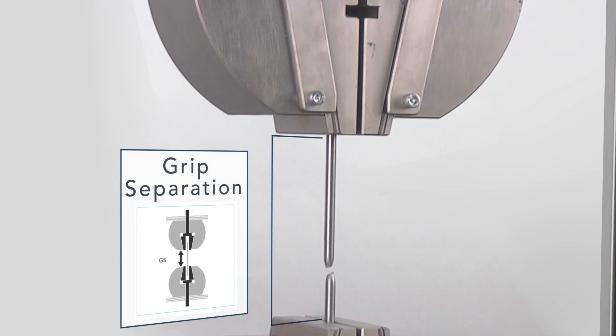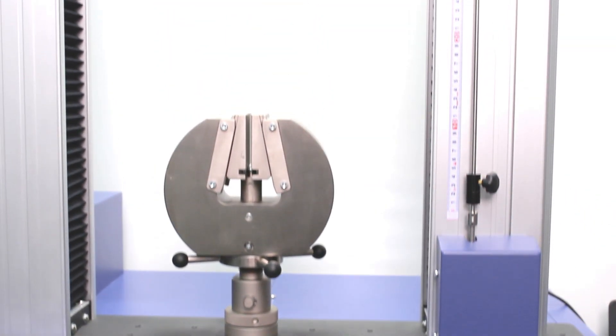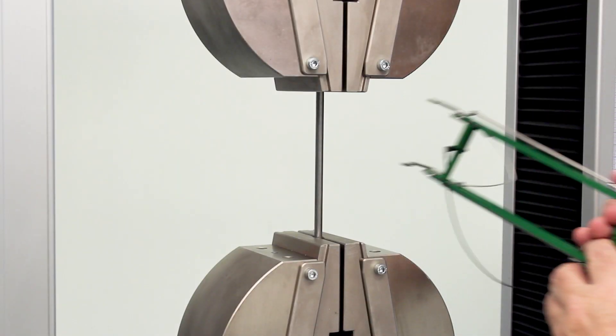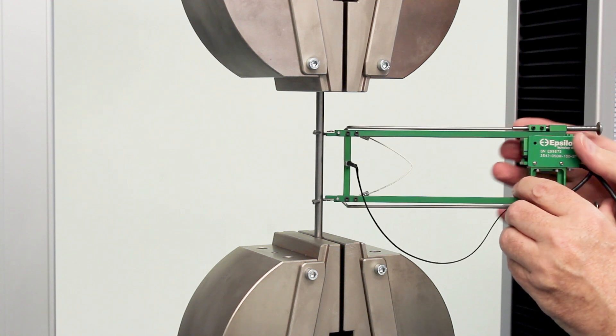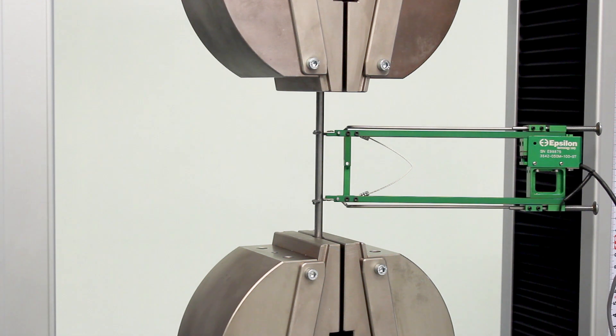Many applications allow the measurement of grip separation to determine elongation or compressive displacement. The OmniTest uses precision encoders to measure such crosshead movement. However, for those tests requiring more precise measurements of strain taken directly on the specimen, an affordable range of contact extensometers is available for use with the OmniTest.